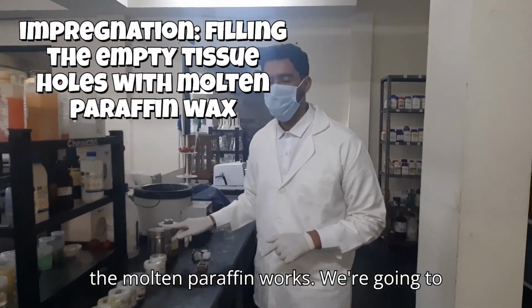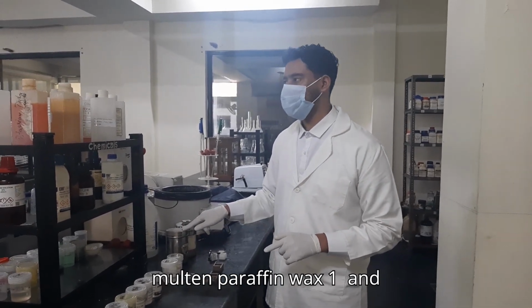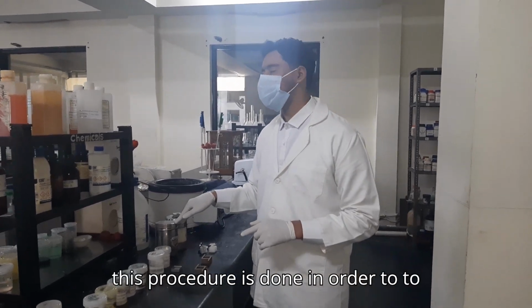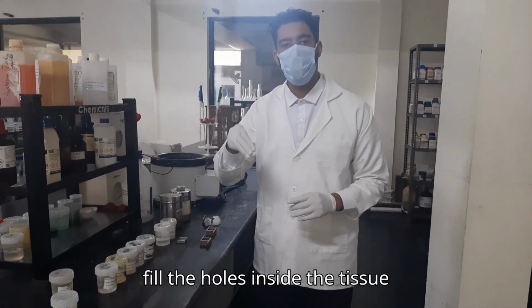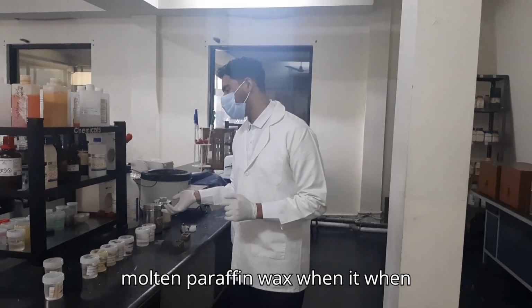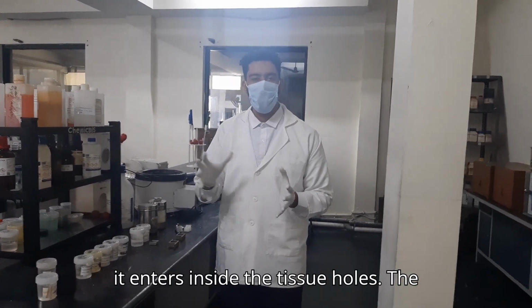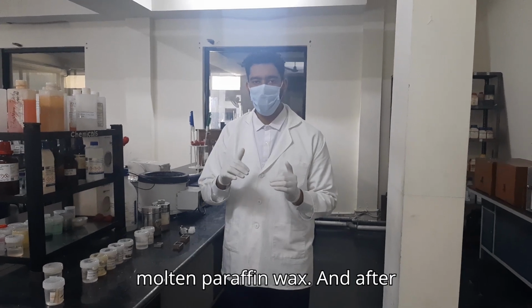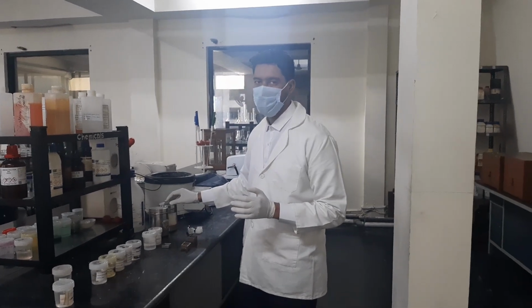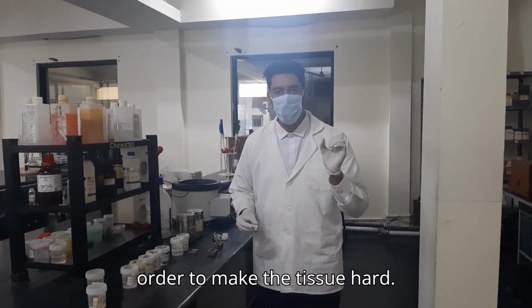Impregnation is done in molten paraffin wax. We are going to have two changes also: molten paraffin wax number 1 and molten paraffin wax number 2. This procedure is done in order to fill the holes inside the tissue, so that the tissue can be hard. When the molten paraffin wax enters the tissue holes, they become filled with it. After impregnation, the wax will solidify in order to make the tissue hard.